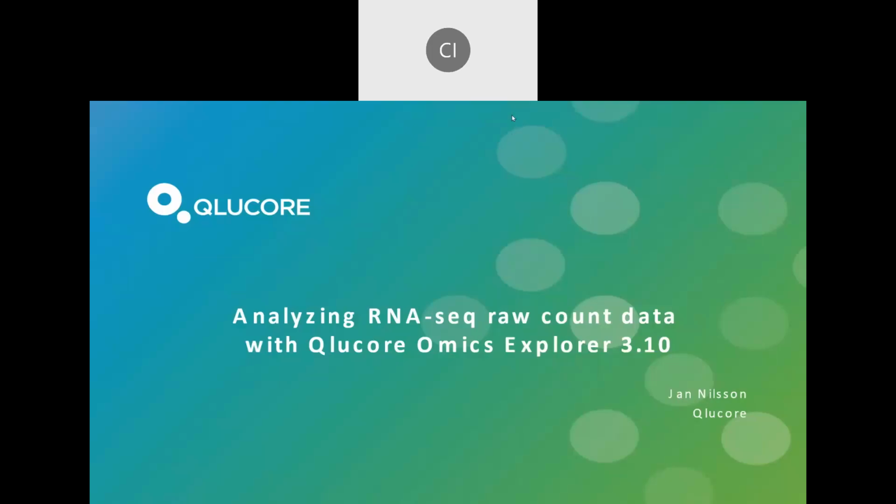Hello everyone and welcome to this Qlucore webinar about analyzing RNA sequence raw count data. And we're going to use the new Qlucore Omics Explorer 3.10 product for this. For those that are new to the product, I hope this will give you a first feeling for how you can work with RNA sequence data in the product.